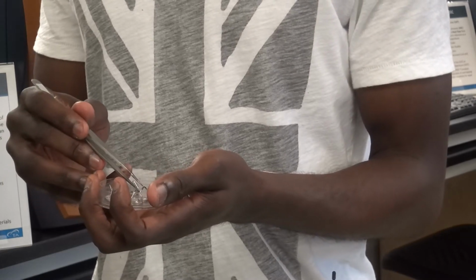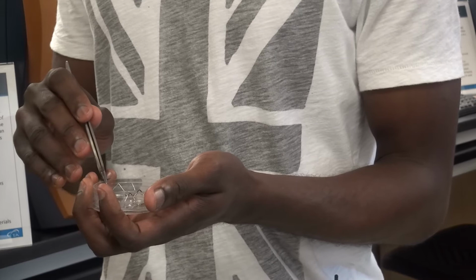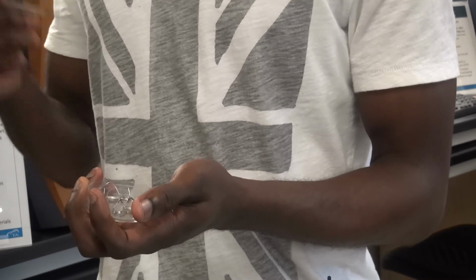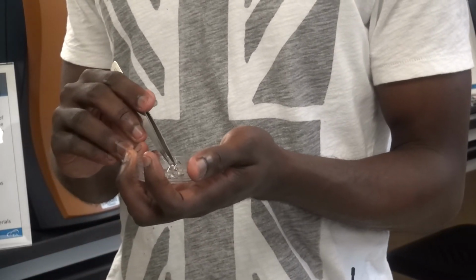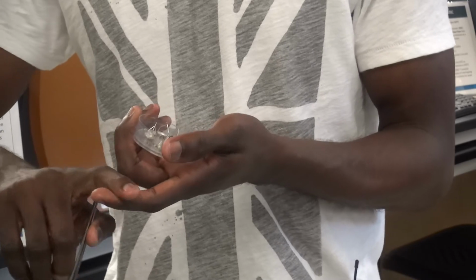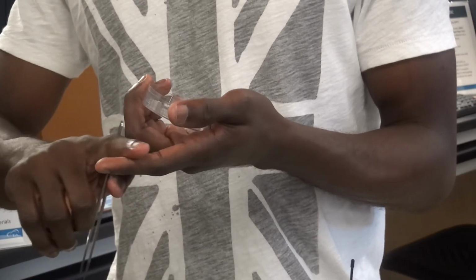Okay. What's the temperature they're going to stick together? I don't know the exact temperature at which they stick together, but I do know that it happens. An older version of these did not have the black tips on them, and I experienced a lot of sticking issues. So they're almost like trying to fuse together, basically platinum on platinum, right? Okay, yeah. So at higher temperature, they almost try to fuse together.